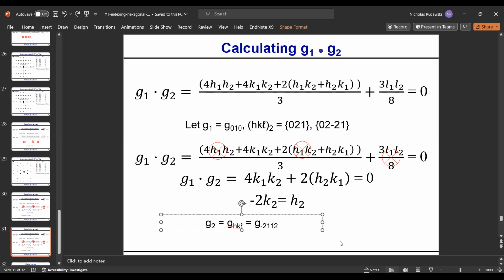So let's say then that I let K2 be 1. Well, that's not going to work either, because then I have an index of 1. My first 3 indices have to be some combination of 0, 2, and 2 bar. I can't have anything besides that. So there's really no way for this to mathematically work either. The only way this ends up working is if I have 0 for this and 0 for this, but then I end up with 2 zeros, and I'm only supposed to have 1 zero.